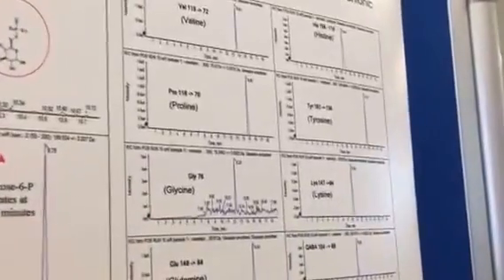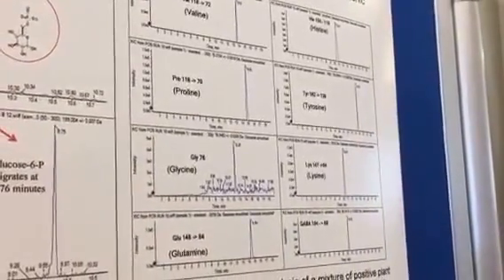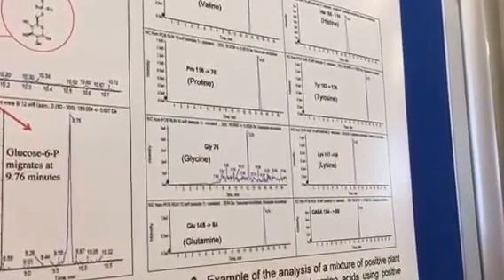Similarly here we show examples of other metabolites, and a great example here also looking at citrate and isocitrate, again two isobaric compounds which are separated well for the same reasons.